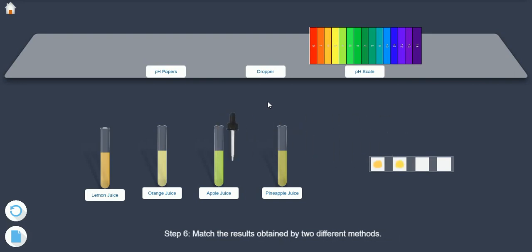Step 6: Match the results obtained by two different methods.